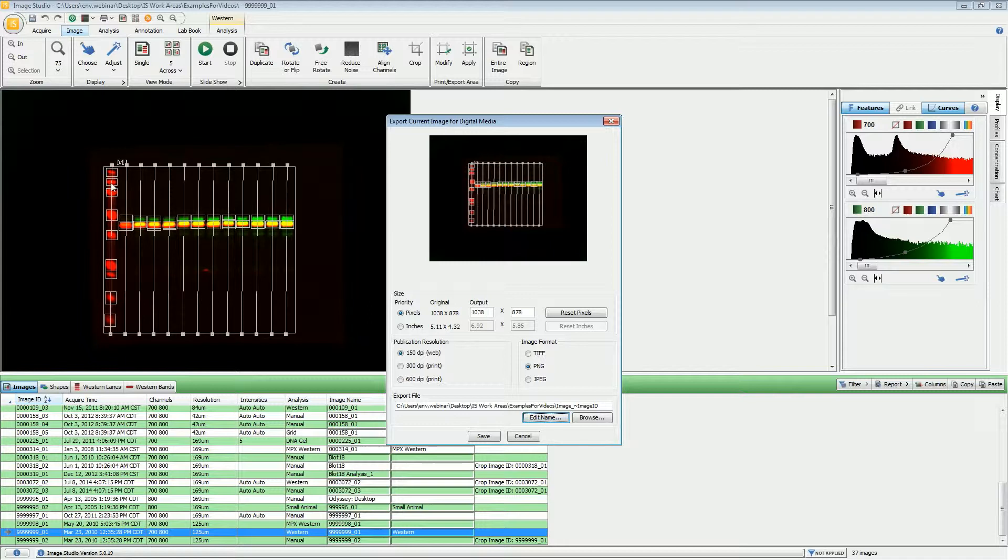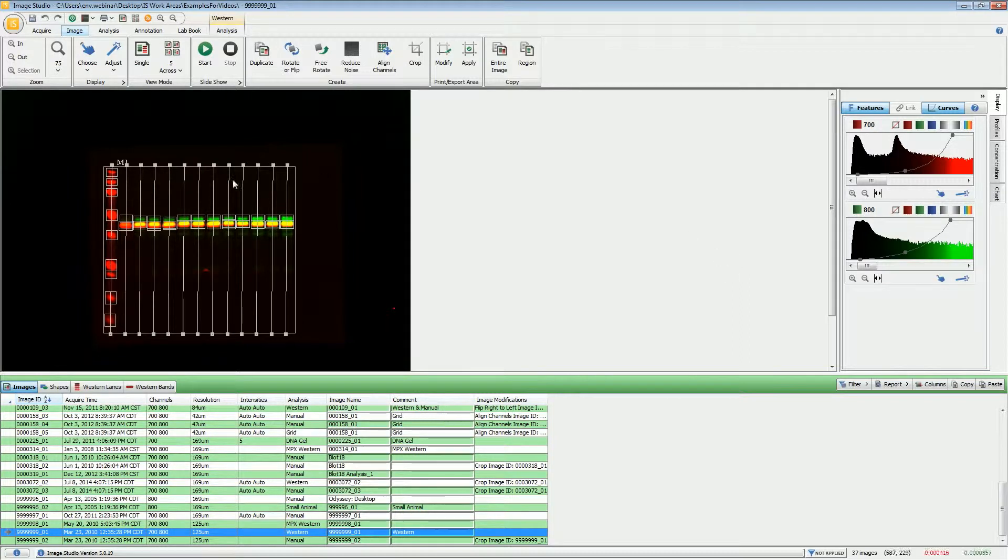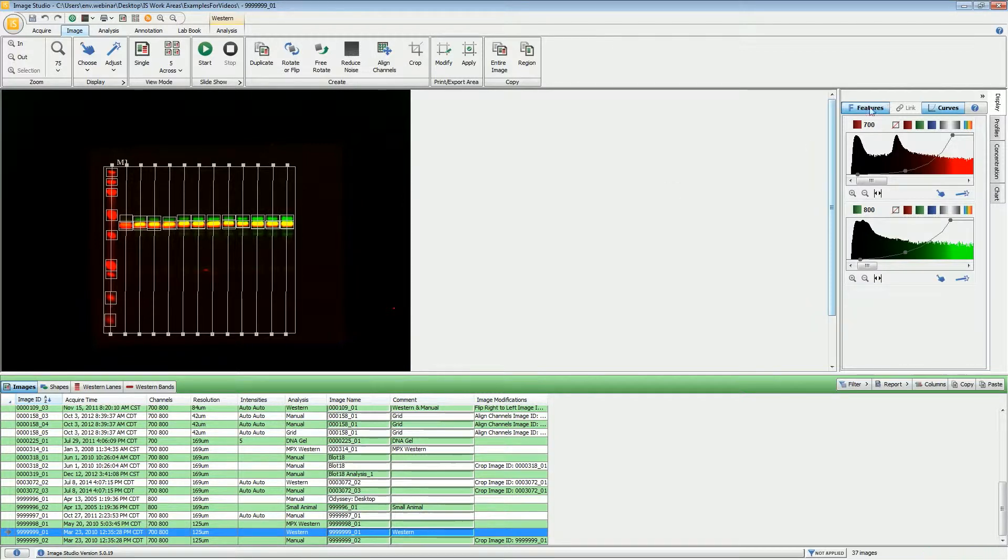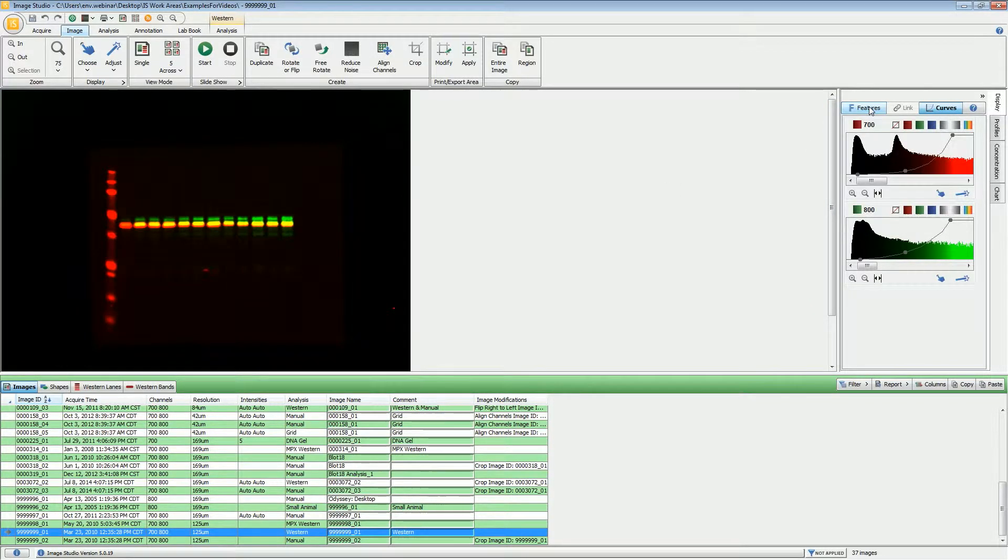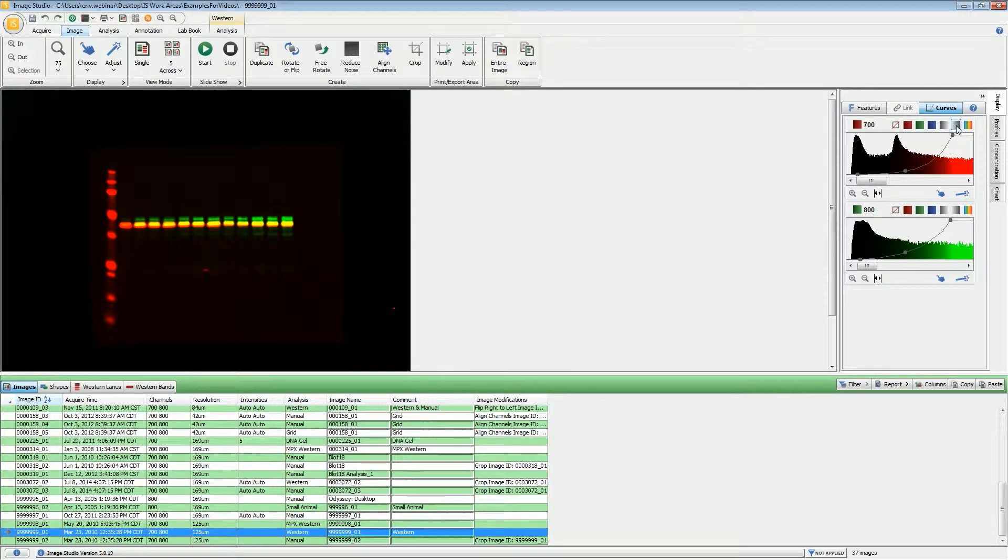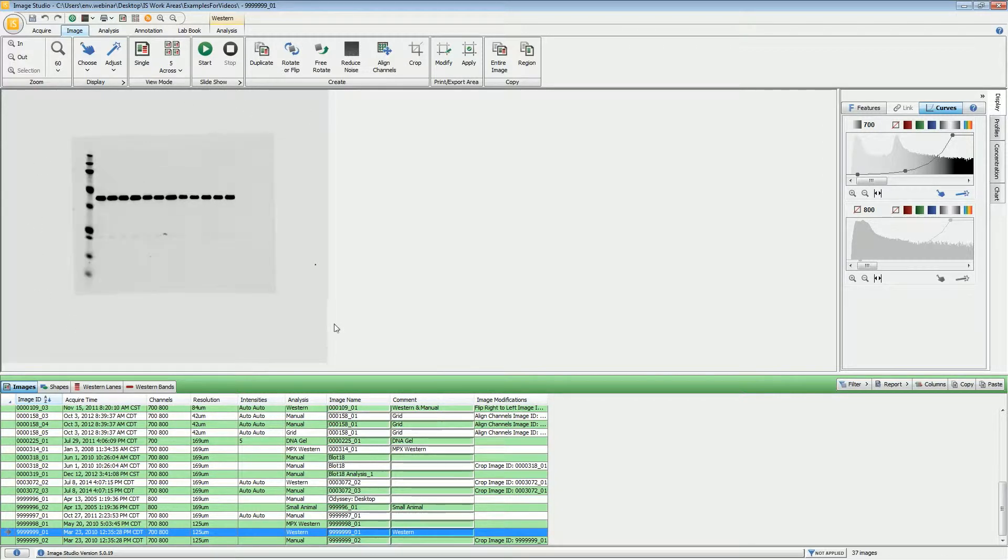The image export looks exactly like what you have here on the screen, so we're seeing all of the lane lines from this Western analysis and all of this empty space out here as well. If you do not want to have the annotations or band markers or shapes shown during the export, you can click on the Features button right here, and that will hide everything. Also, if you just want to use a black and white image, you can do that.